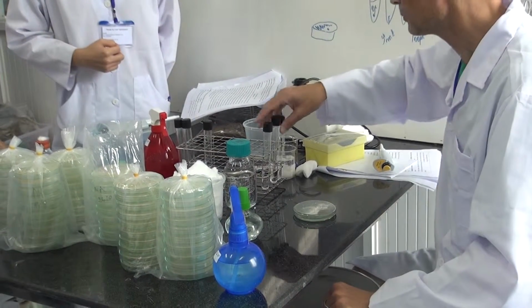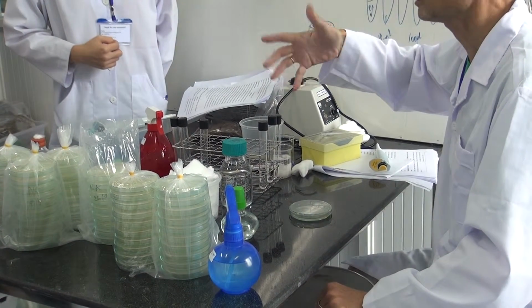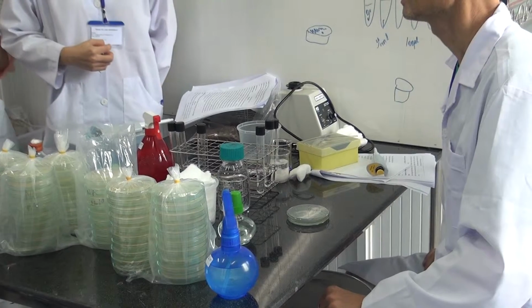Each pair does one rhizosphere and one soil. Okay, I see. Thank you.